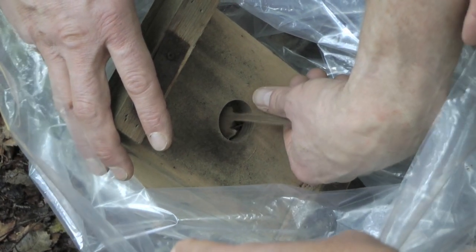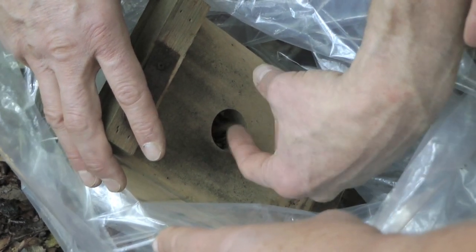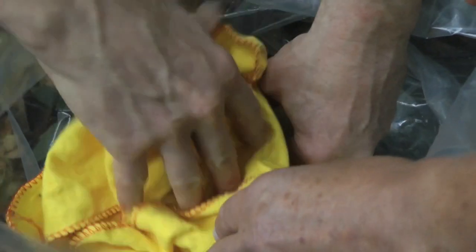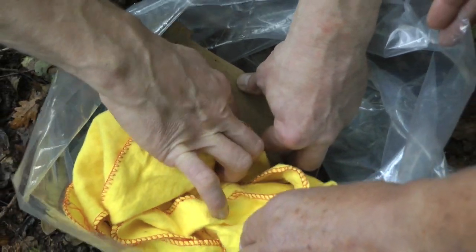Again, be very careful with the tail. Secure the box with a bung before putting it back on the tree, but make sure you remove the bung before you leave.